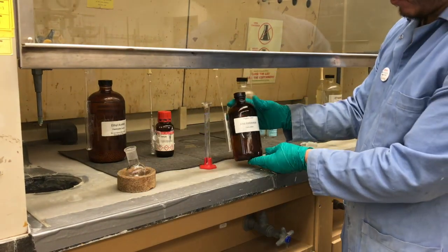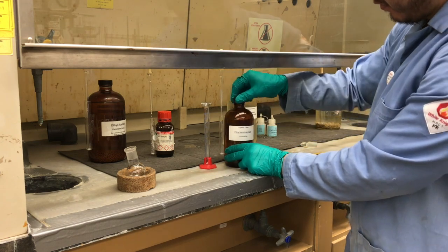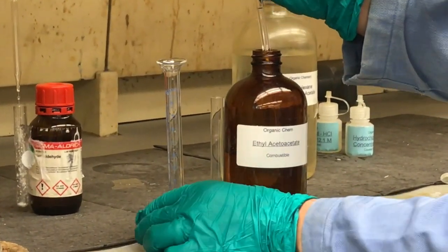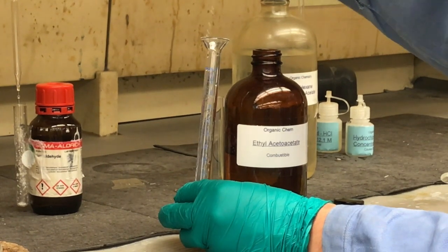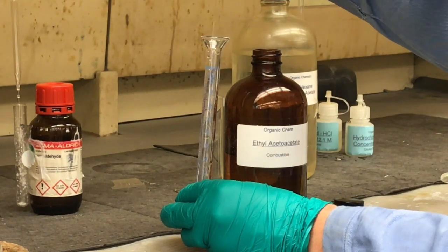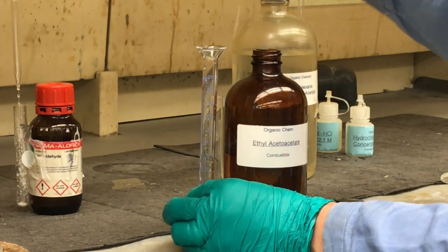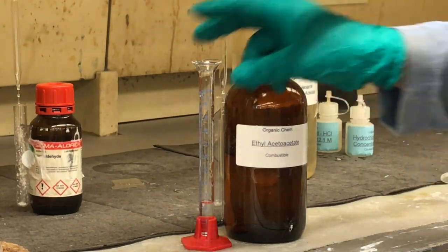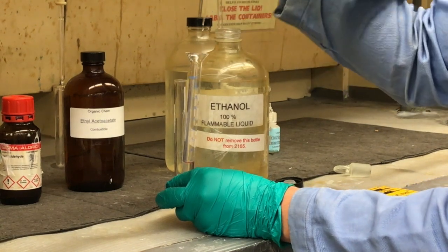Okay, so now we're going to measure out about 2.4 milliliters of ethyl acetoacetate. And lastly, we're going to add 5.0 milliliters of ethanol.